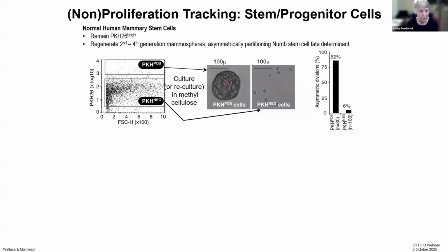Kathy? All right. So this is, flip your head around and say, okay, Paul just pointed out that you can have cells that do not respond to a stimulus and just sit there and do nothing. And those cells will stay bright. So that property has been used to find rare stem-like or very slowly dividing cells in this particular example in either normal or abnormal mammary epithelium.